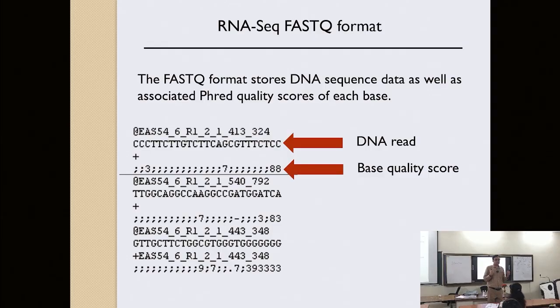And if you are a biology student, once in a while, you may actually have to do such analysis. Because it's an era of big data, and RNA-seq data or DNA sequencing data are big data. So it is possible that you may encounter these data at some point of time and you would want to analyze them. So make sure that you have saved the RNA-seq pipeline that we have provided to you, right? So you will try, and if you have difficulty, then let us know. I will ask my student to help with that.